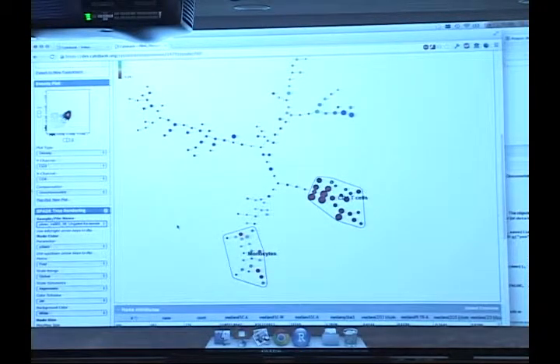This is how you move through the tree and get an idea of what the functional activity of these cells is in the different trees. There are a lot of different things you can change with the coloring parameters, but this is the basic overview of how you annotate a tree and explore the functional behavior in your measured data.